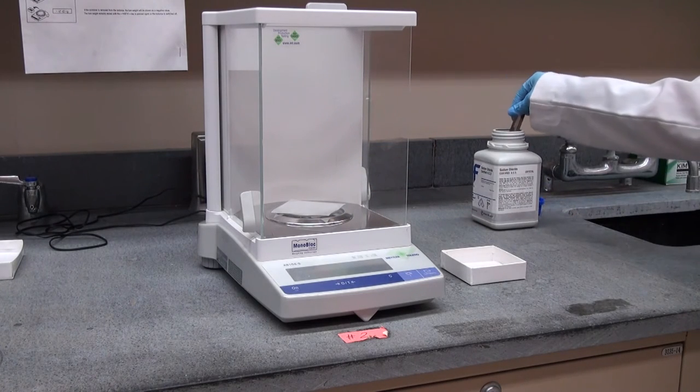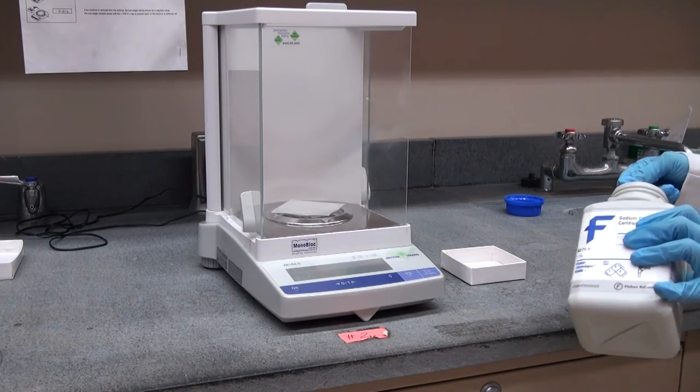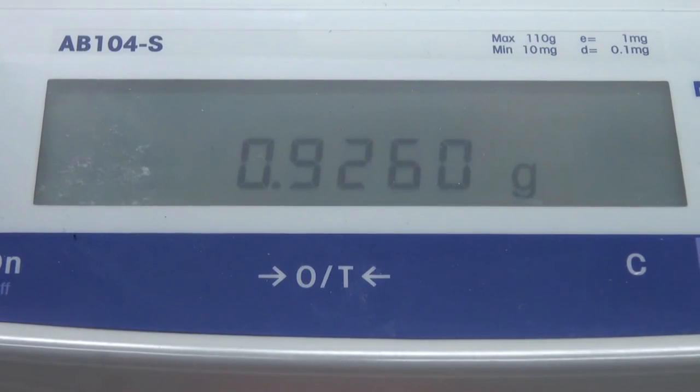Once we've tared the balance, we can open the door and add the material that we're seeking to weigh. After having loaded the sample onto the analytical balance, we can close the door. We may have to wait one or two seconds for the balance to equilibrate, but now seeing that the scale has stopped moving, we can read the mass measurement to be 0.9260 grams.